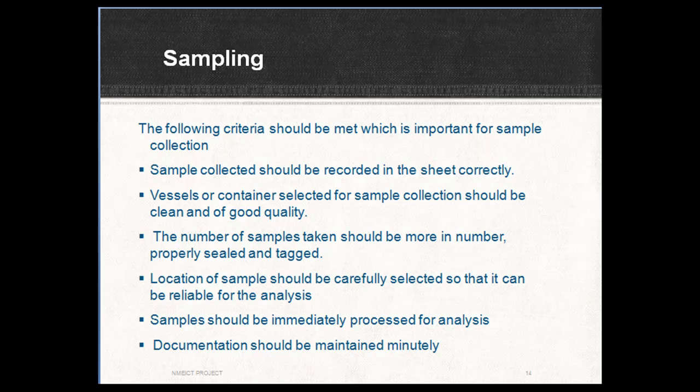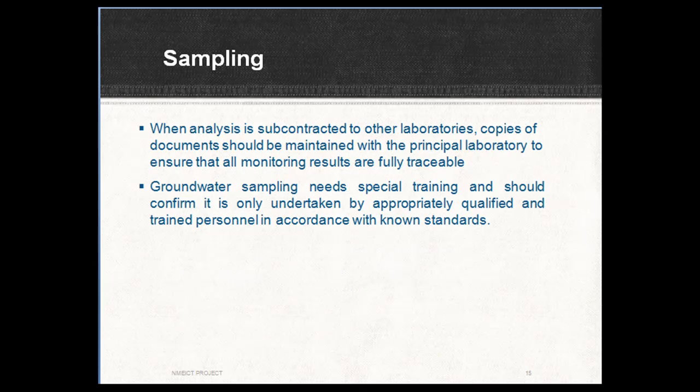Samples should be immediately processed for analysis. If not, then they should be preserved appropriately, meeting international standards. Documentation should be maintained minutely. When analysis is subcontracted to other laboratories, copies of the documents should be maintained with the principal laboratories to ensure that all monitoring results are fully traceable.